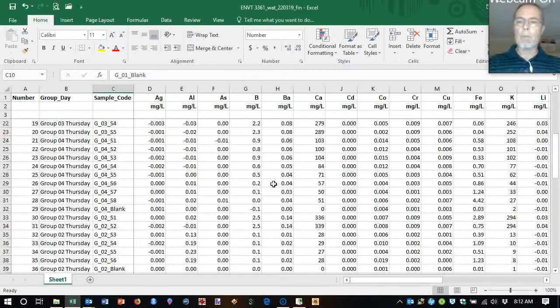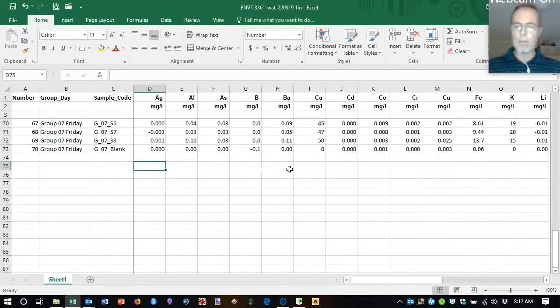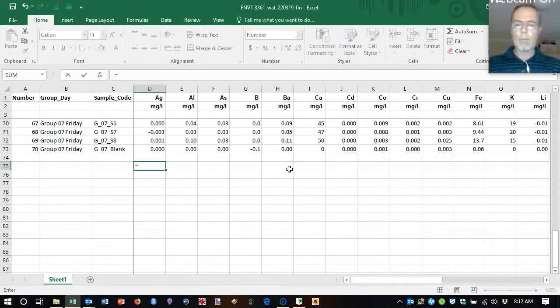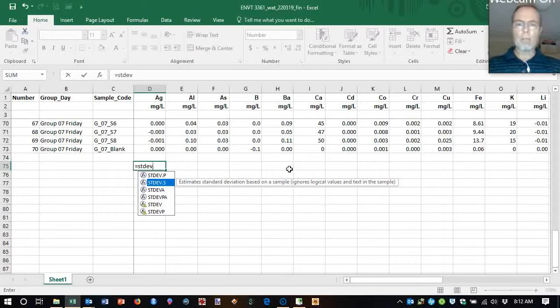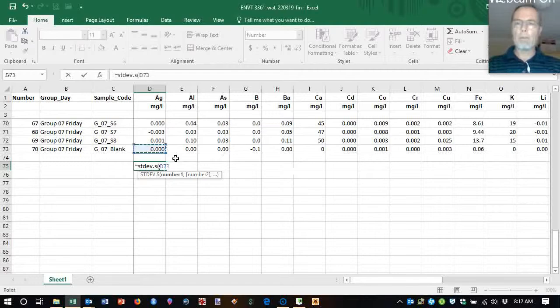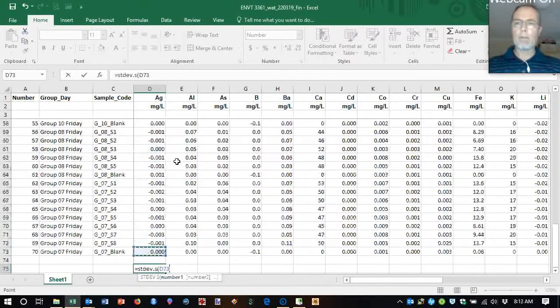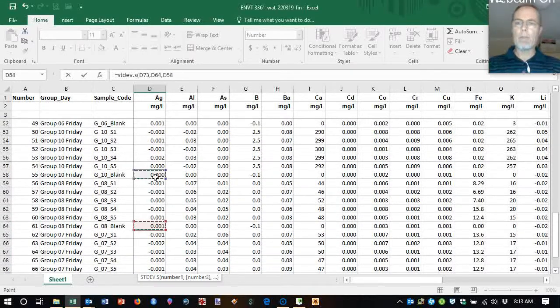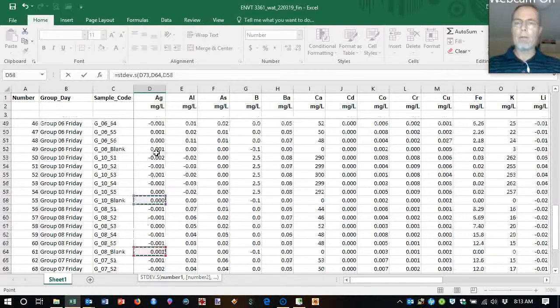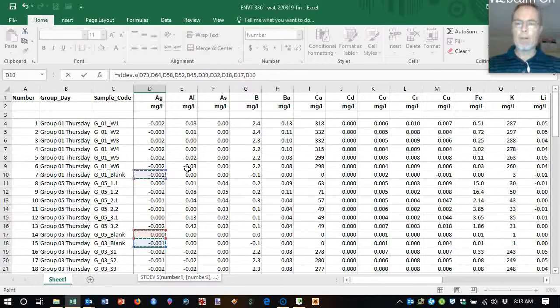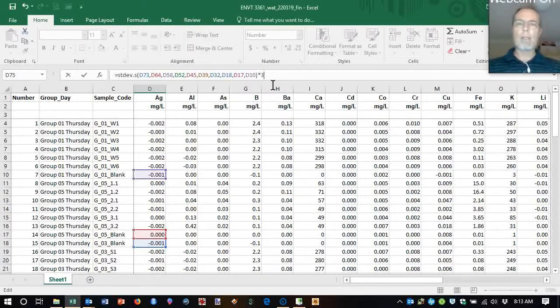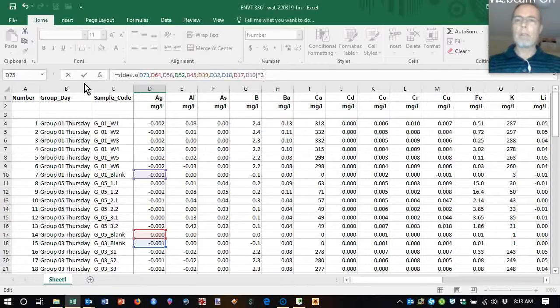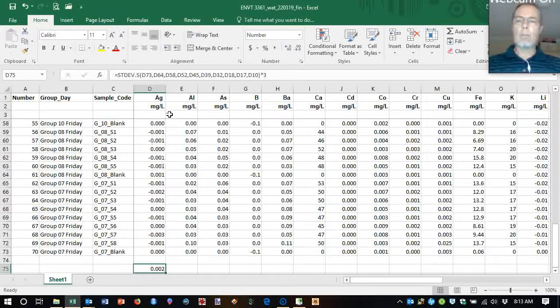So what I'm going to do first is actually calculate detection limits. The way that we do that is to pop in a formula here. I'm going to calculate the sample standard deviation of our blank values. I'm going to select multiple blank values here just by holding down the control key with each one. Every group more or less has got a blank value and there's the formula for our standard deviation. Conventionally we multiply that standard deviation by three and that gives us the lower limit of detection for that particular element.